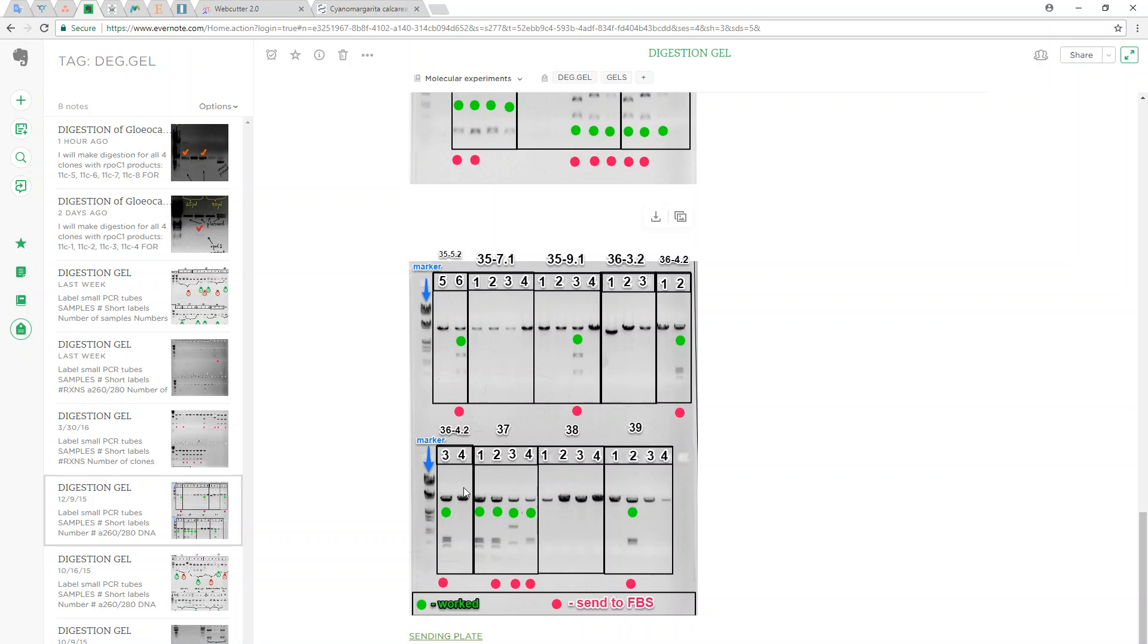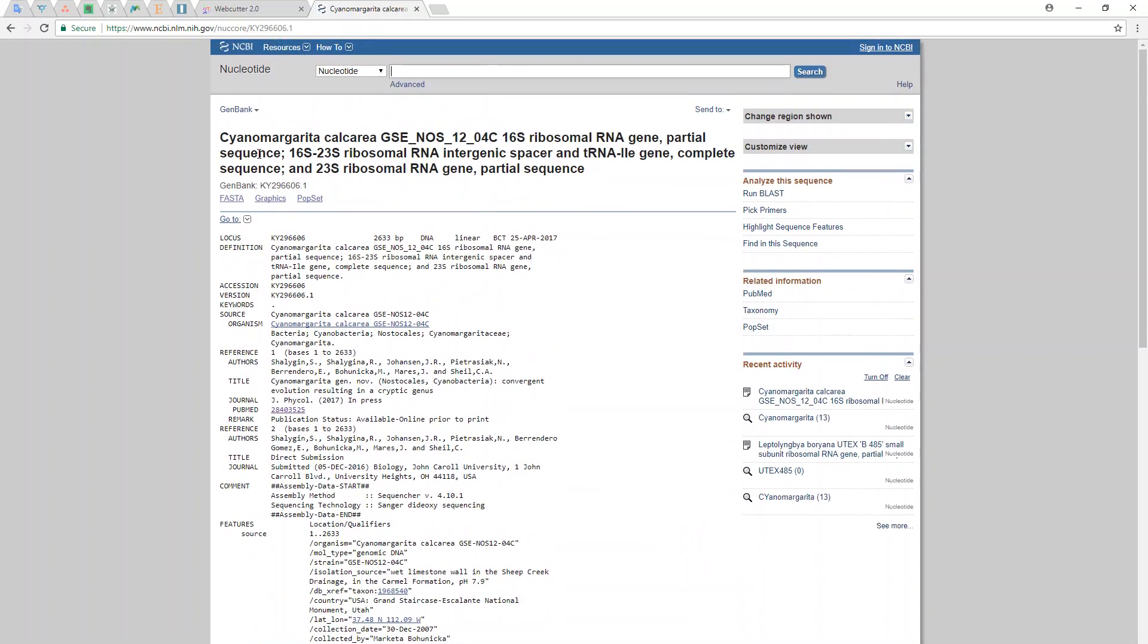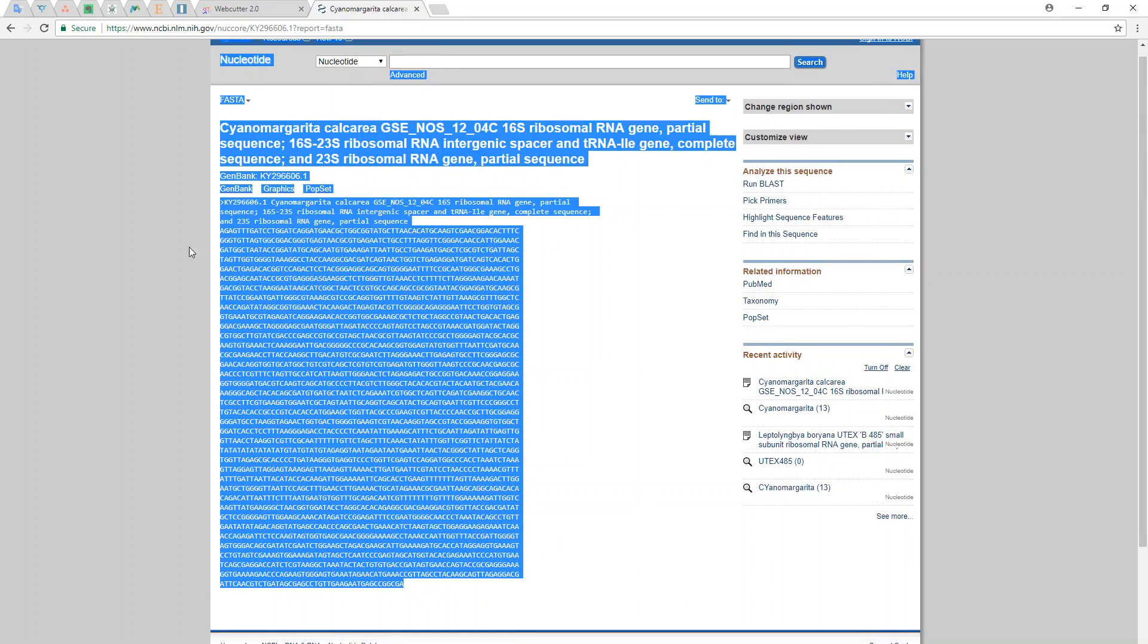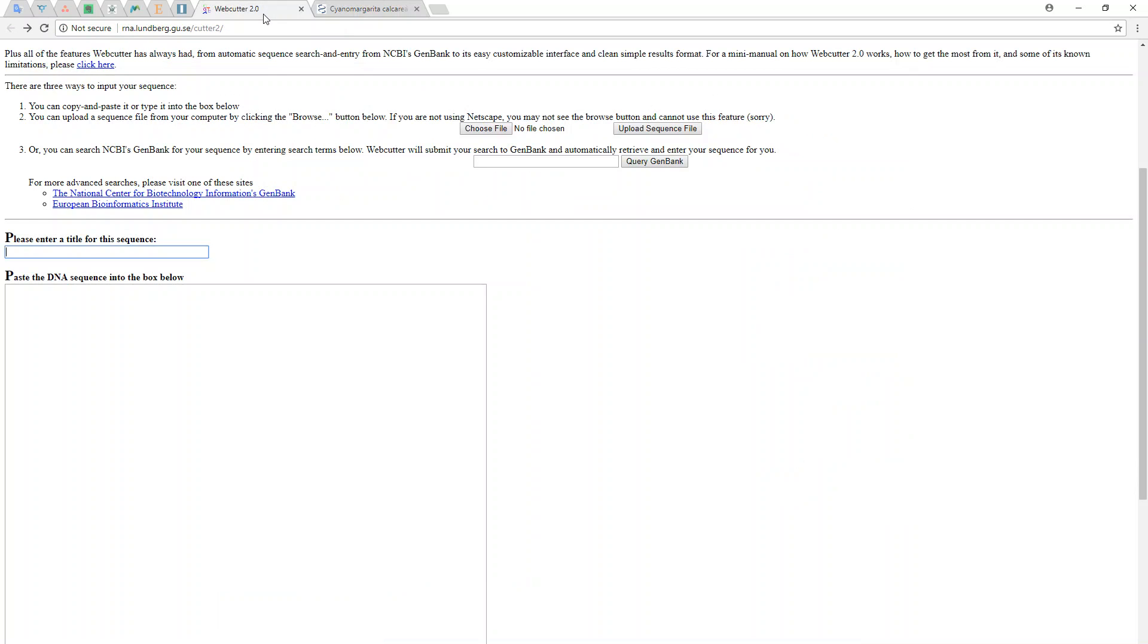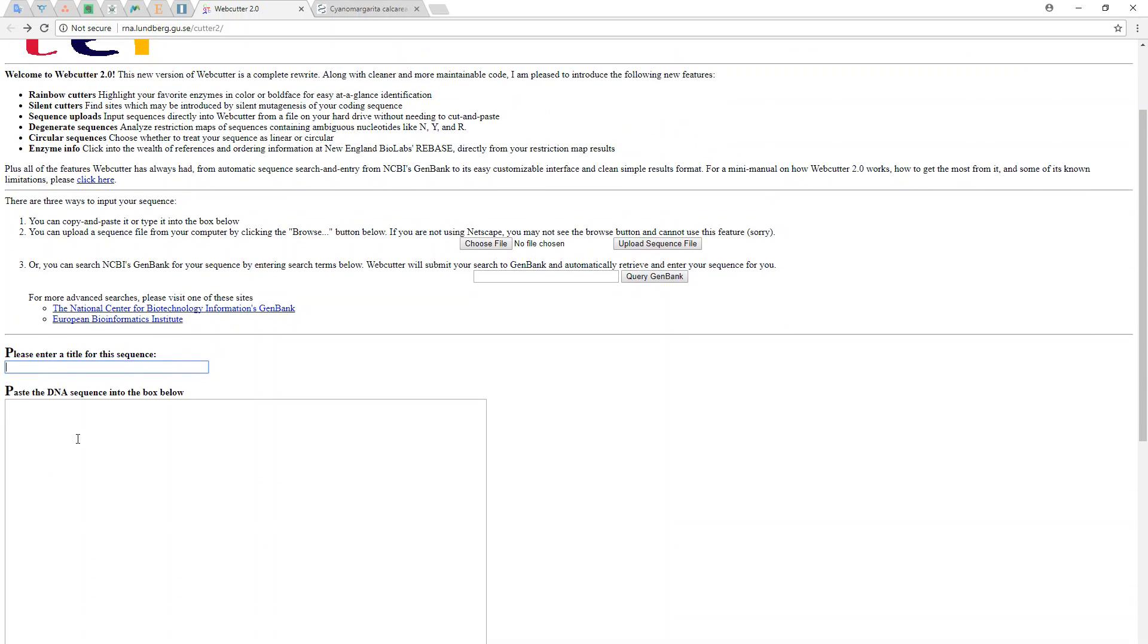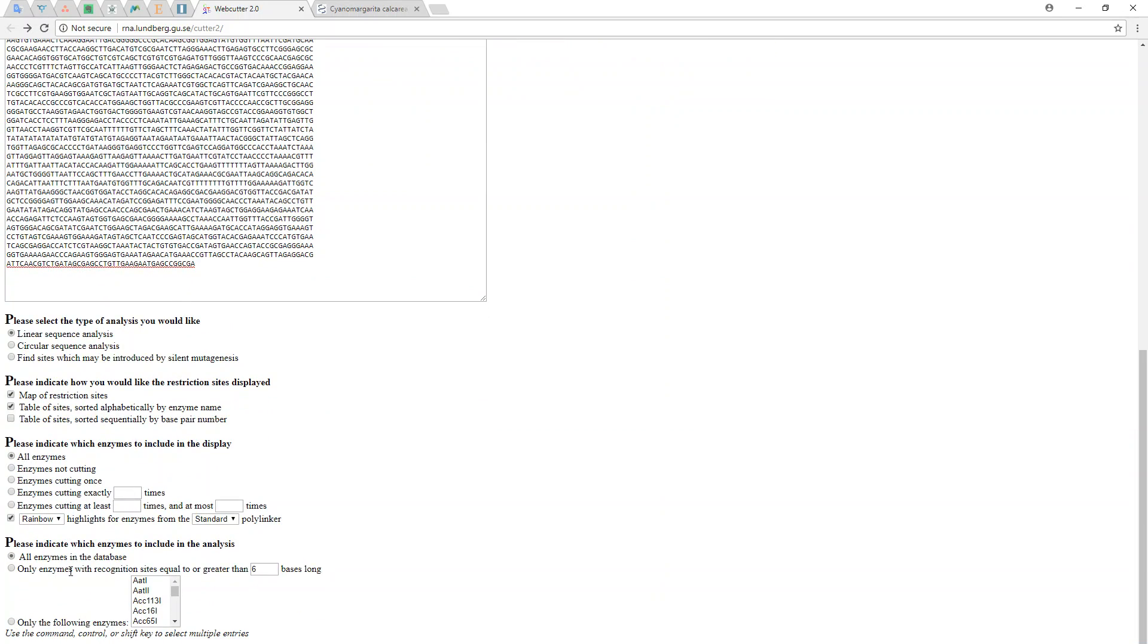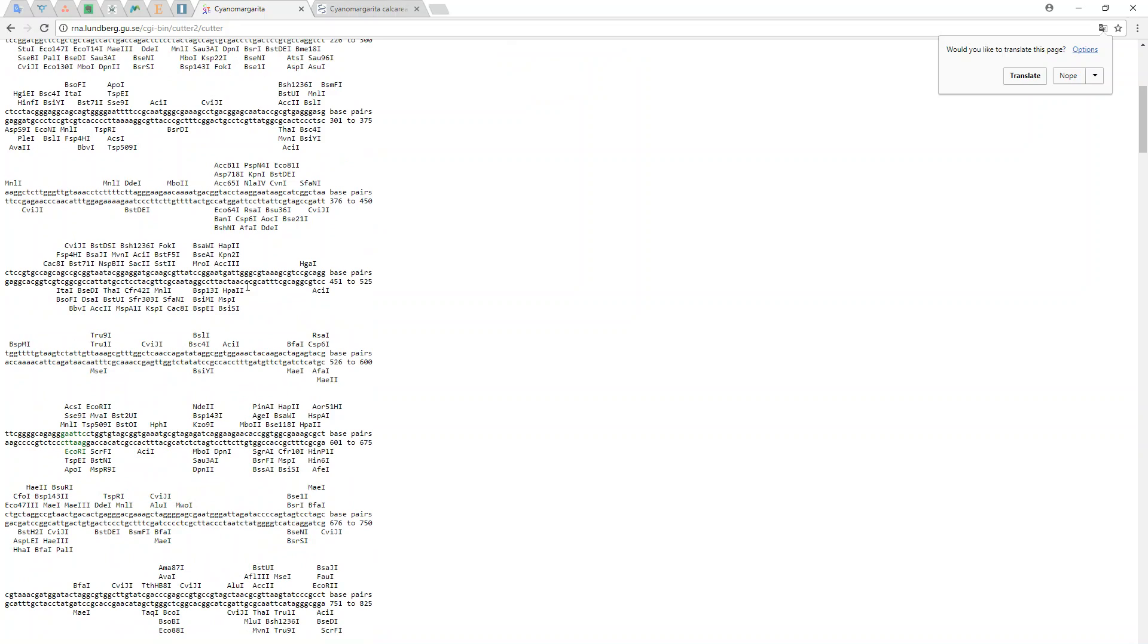After we submit the sequence and send it to the sequencing company, we get the nucleotides back. Now we can use this software called web cutter to insert this sequence, and we can say cyano margarita.